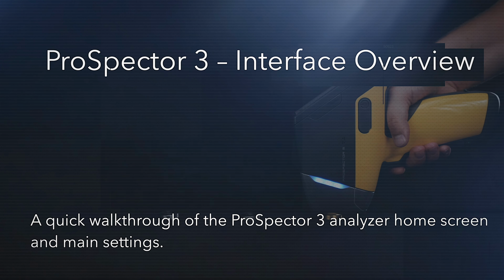The second option is pull once to start and pull again to stop. It's more convenient. You just press the trigger once and release it, and the analyzer starts measuring. And when you see the results and they satisfy you, you just pull again and the analyzer stops.